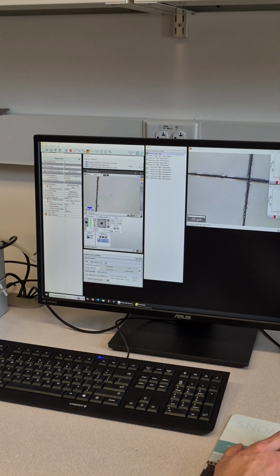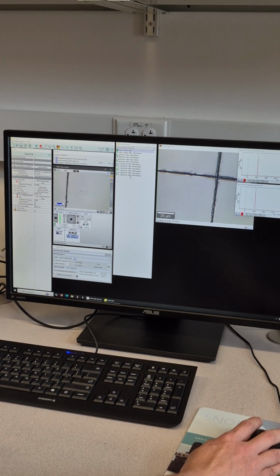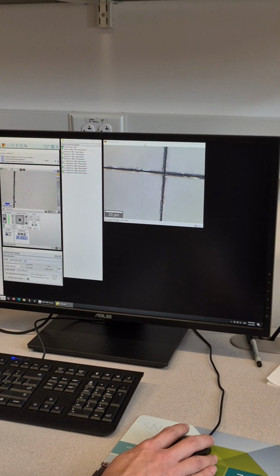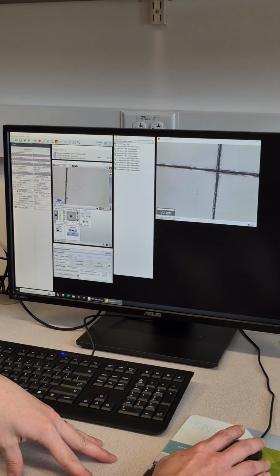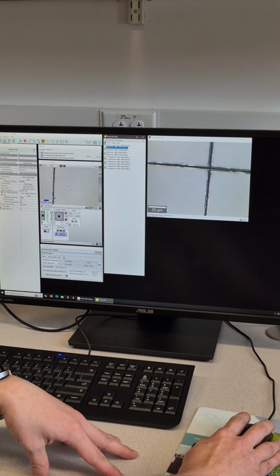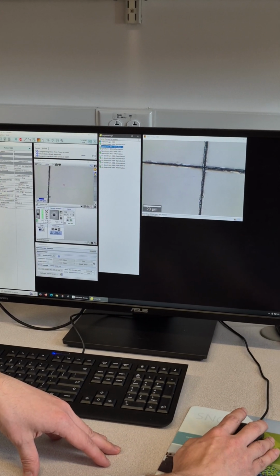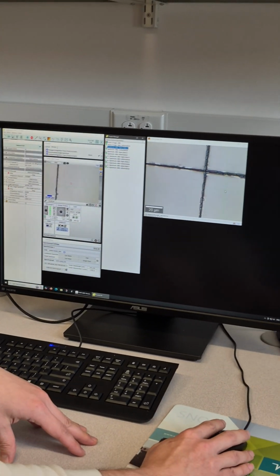So this is how you collect data. After you have a long list of spectra, 001 to maybe 011, 012, you go back and you want to show in the publication or your presentation this image. You want to show I have spectra 1, I collected somewhere. I have spectra 2, I collected somewhere. You don't want to tell people you collected somewhere. You want to tell people I collected exactly here. But most of the time you don't remember where you exactly collected 1, 2, 3, 4, 5, 6.